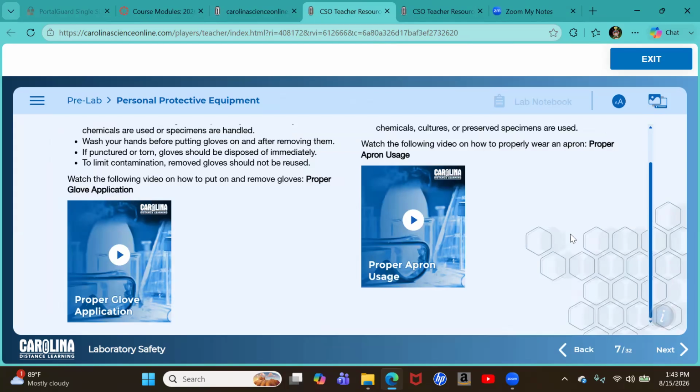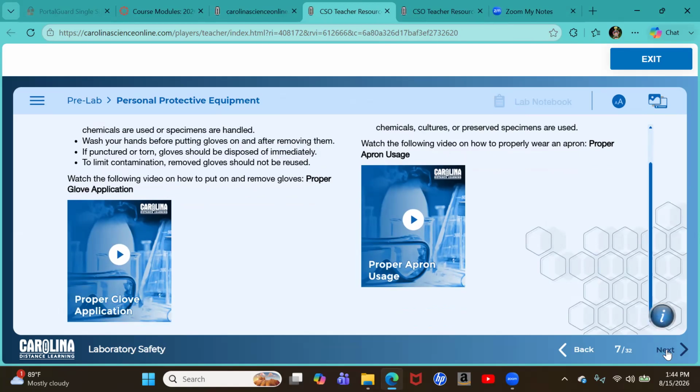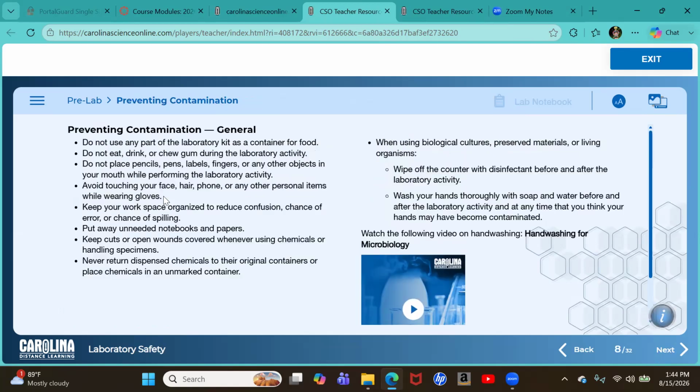Do not dispose of it until the end of the course. If you do get spills on it, with gloved hands, you can wipe that chemical material off. And please remember to always store the apron away from children and pets.